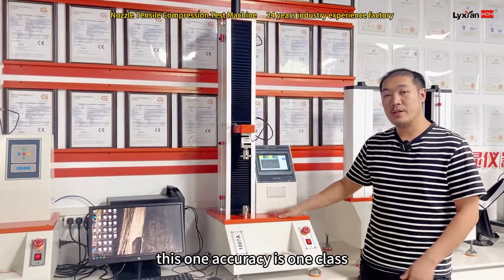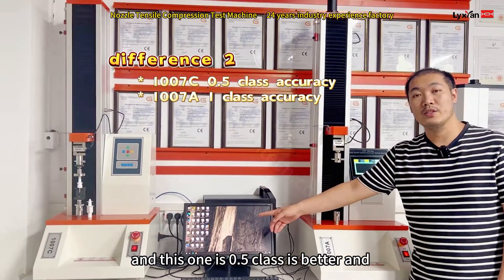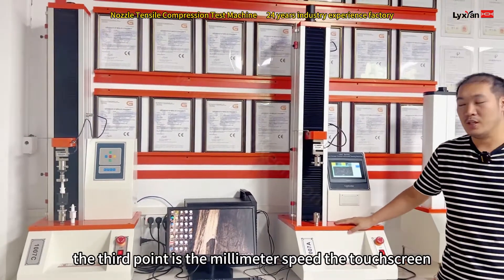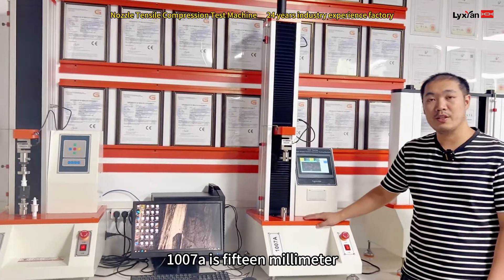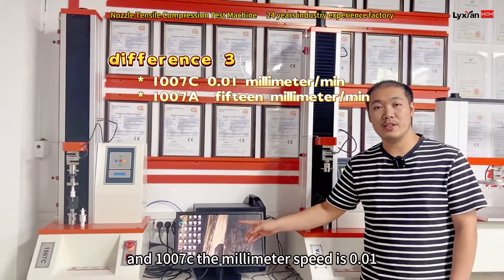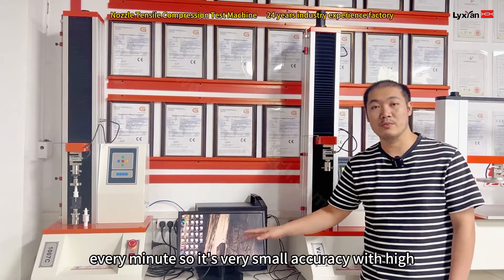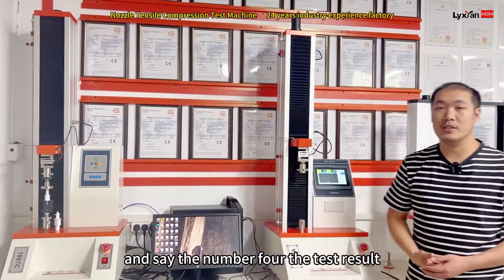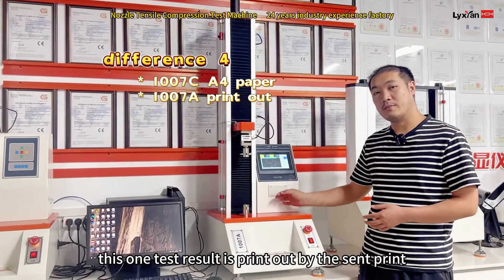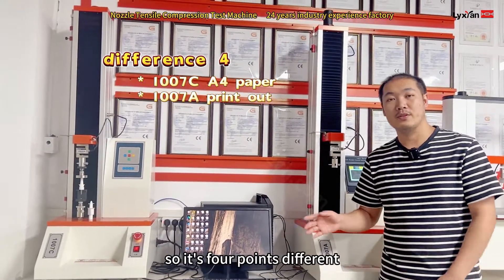The third point is accuracy: the 1007A accuracy is Class 1, and the 1007C is Class 0.5, so the 1007C is better. The fourth point is the millimetre speed: the touchscreen 1007A is 15mm per minute, which is very small so accuracy is high. The tested result from the 1007A is printed by a thermal printer, and the 1007C prints on A4 paper. So those are four points of difference.